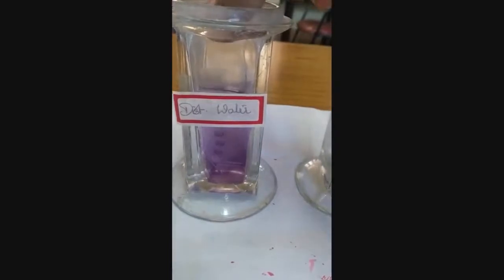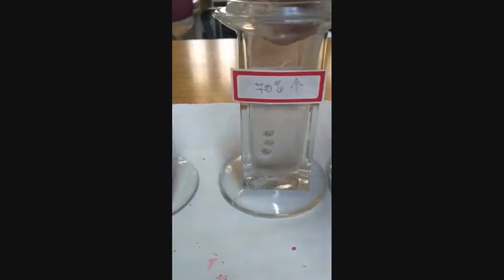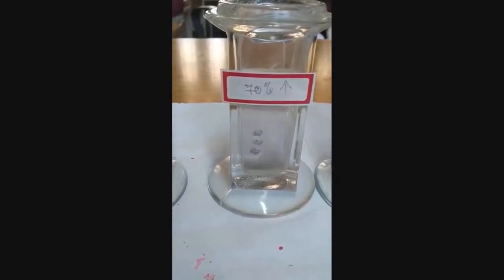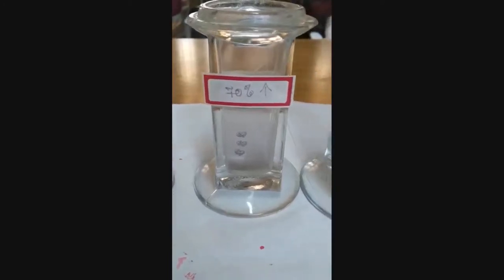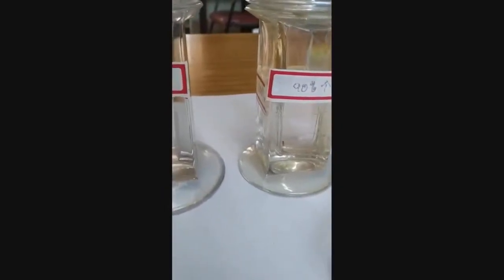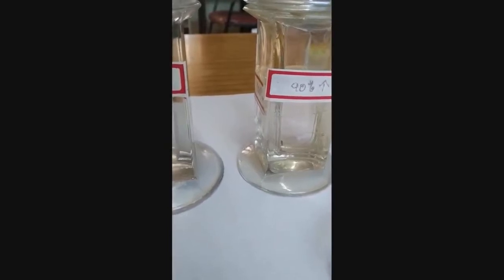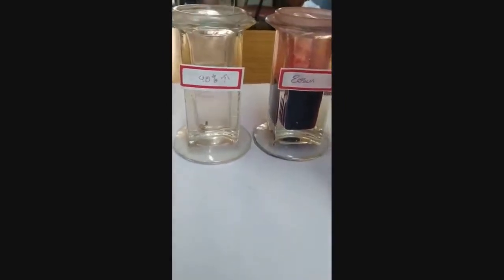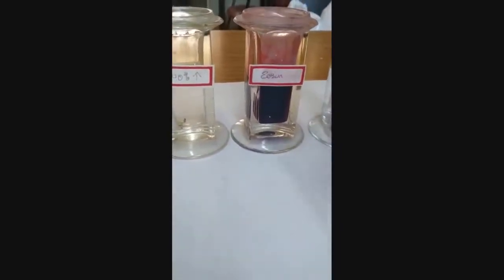Remove the slide from distilled water and immerse it in 70% alcohol. We are now upgrading the tissue. This is to remove excess water from the tissue. We have to pass it through 70%, 80% and 90% alcohol, keeping in each for about 5 to 7 minutes. After upgrading the slide through 90% alcohol, take it out and immerse in eosin.